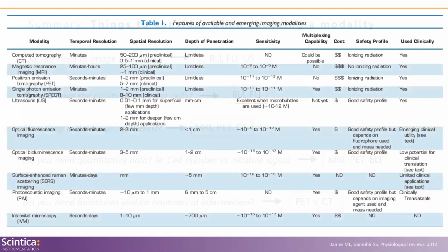And I just want to leave everyone with this resource. So I covered quite a few of these modalities today, but like I said, there are many others. And this is a really great resource, both for those of you who are just getting into imaging and want to learn more about it, but also for those who have been imaging for years. This is a really great review article, and it's a great place to start if you're thinking about diving into an imaging study and you want to know for your specific application what modality you may want to use when considering things like spatial resolution, sensitivity, and cost.